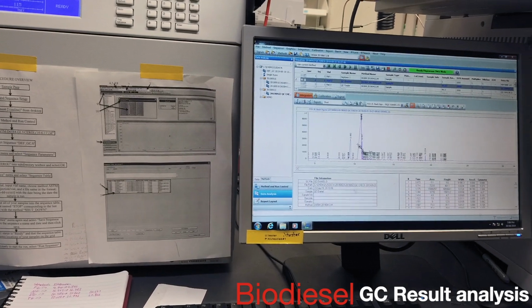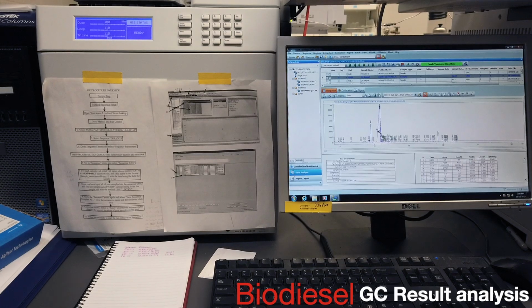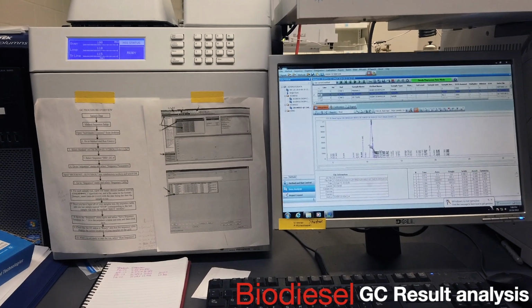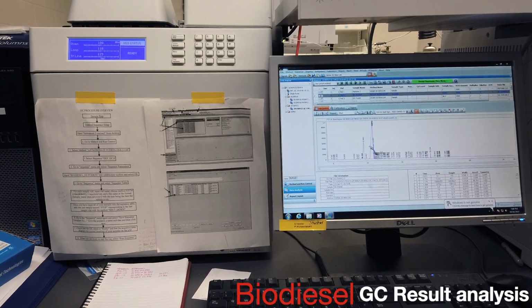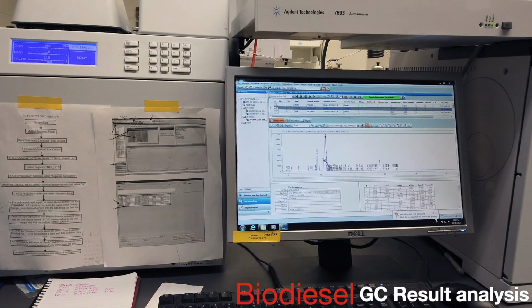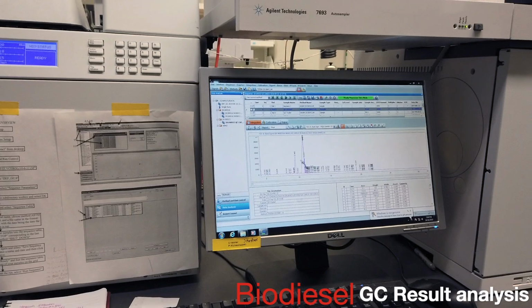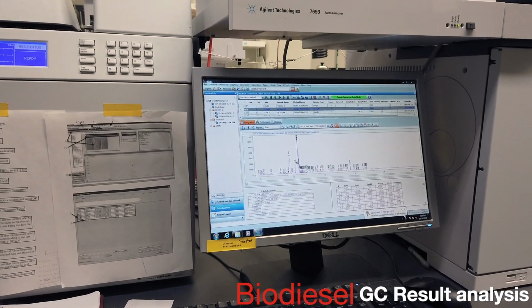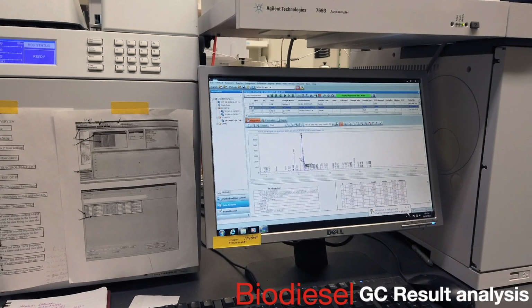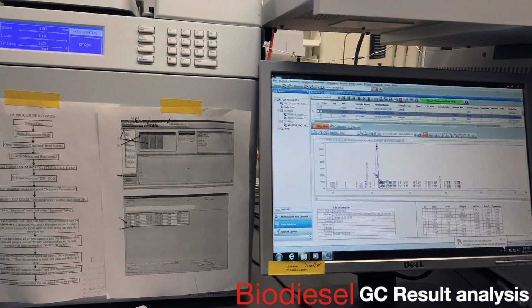It'll be interesting to see what happens, because for the 111 freshman lab, they're actually doing biodiesel. They're making it, purifying it, sending it through an ion exchange, and then distilling off the methanol and the glycerin, and then we're going to come in here and test it. I gave them the choice of canola, soybean, or corn oil, and someone picked corn oil. So it'll be interesting to see what happens with the properties. The only thing about using corn oil is that it's kind of fun in cold weather, but so is soybean.